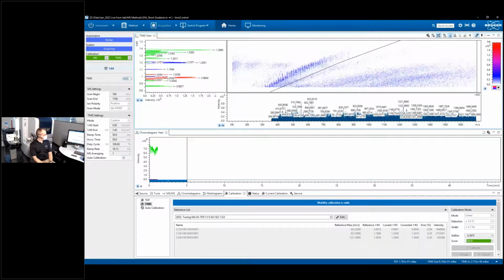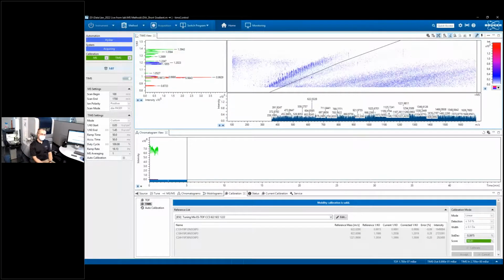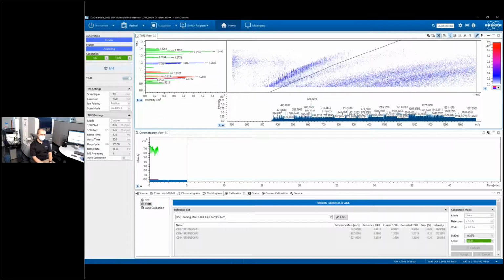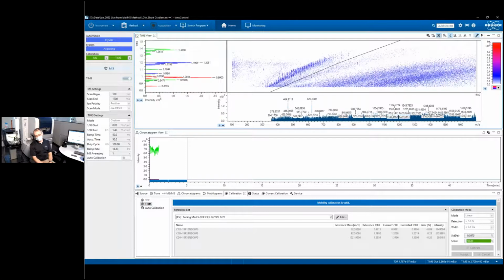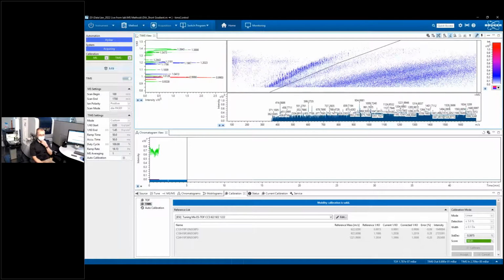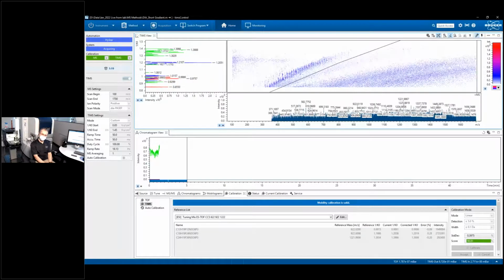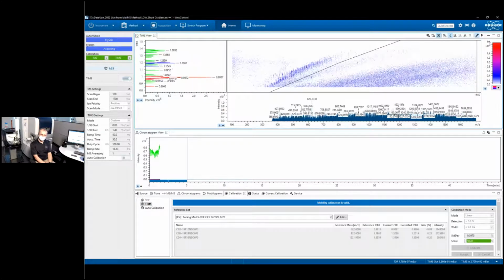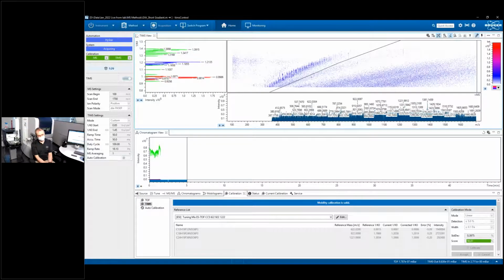Okay. There was a question here about detecting a change in the signal. How do you know if you need to do something with the emitter or the column? Yeah, that's a great question. You tend to see that in spray stability or just the performance of your QC. Those are the two metrics that we use: spray stability, which is just the baseline spray from the system.